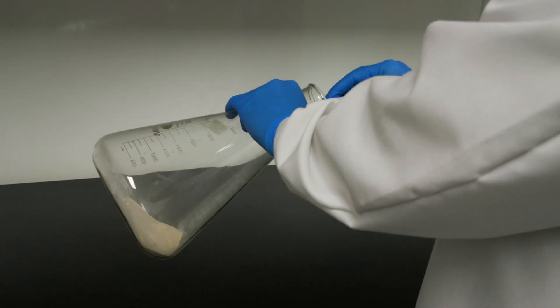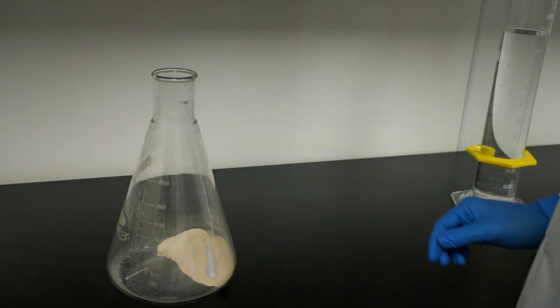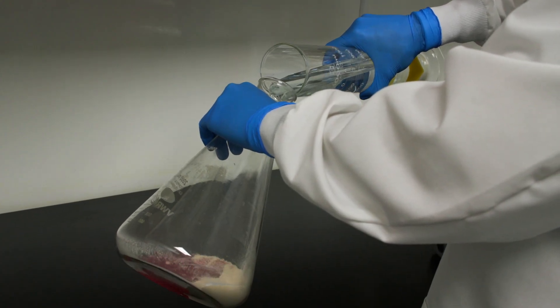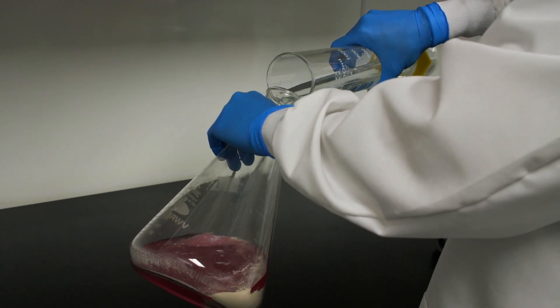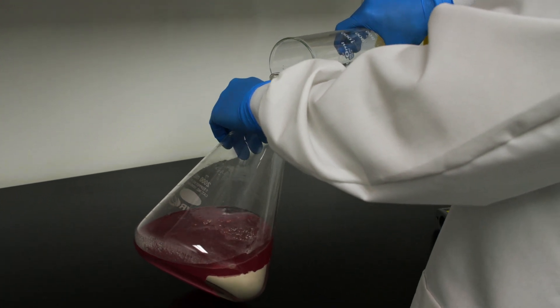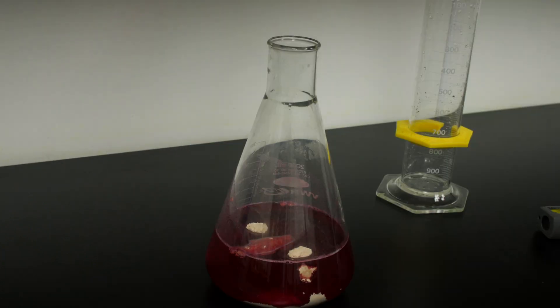Add a magnetic stir bar to the flask. Add one liter of deionized water, using the water to wash down the sides of the flask if some of the powder is clinging to the glass. Cover the flask with foil.